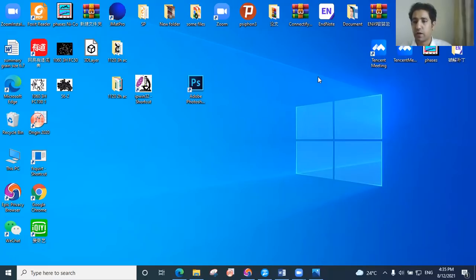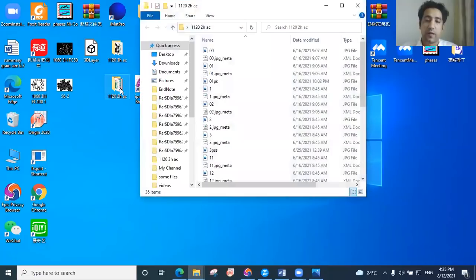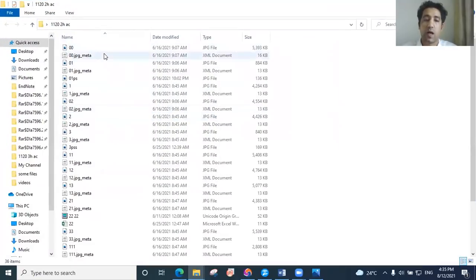If you want to know in details and avoid any errors, follow this video until the end, and you will see the benefits of doing the correct calculation. Here, for example, I have these images from SEM or OM.